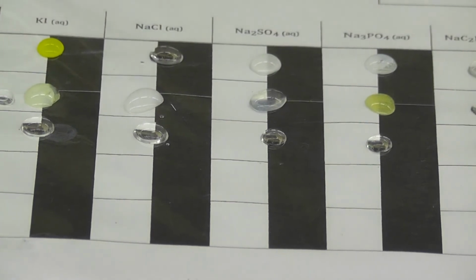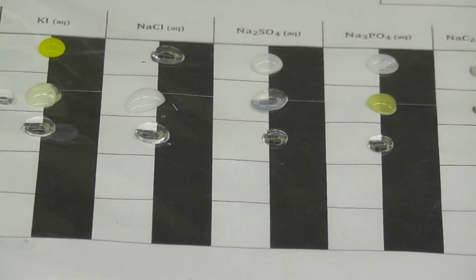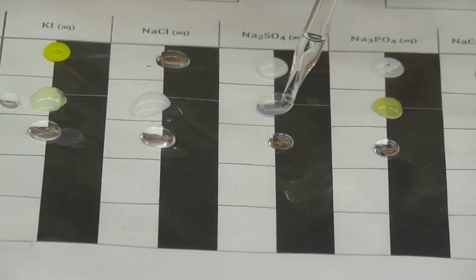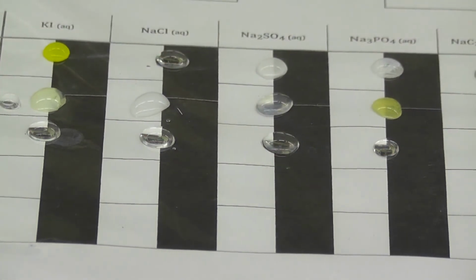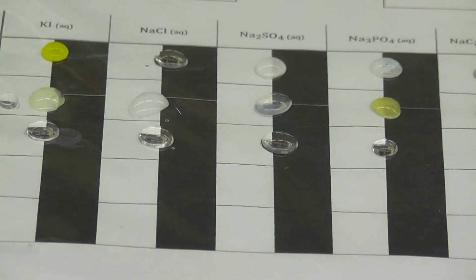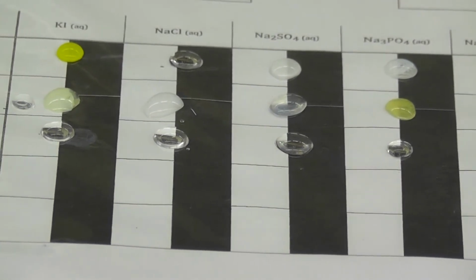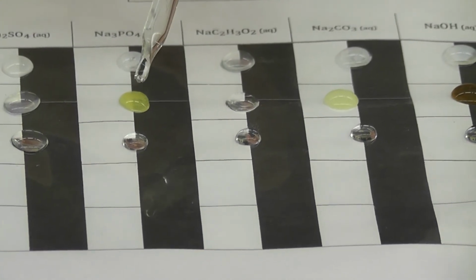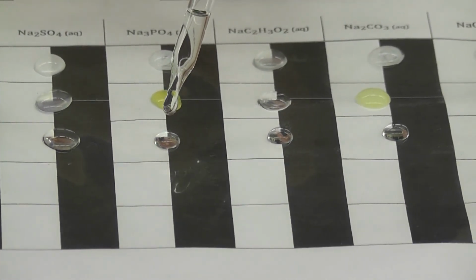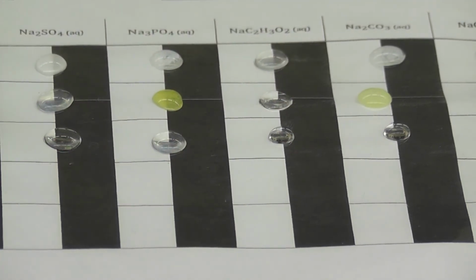Okay, now it's the calcium chloride with the sodium sulfate. Okay, 1 drop of. Okay. The common theme with these two. Okay, now it's the calcium chloride with the sodium phosphate. Okay, add 1 drop of sodium phosphate to this calcium chloride. Okay, there's a reaction there.